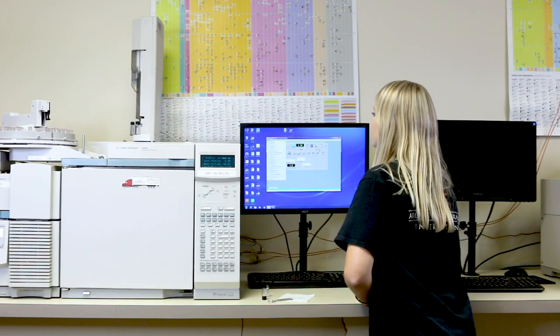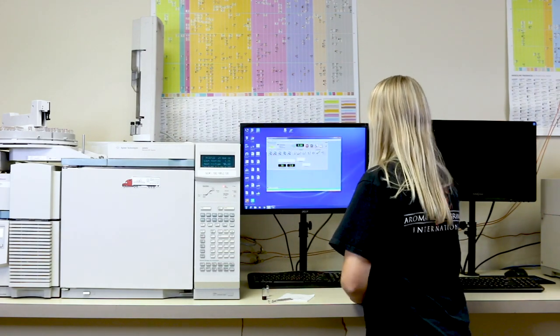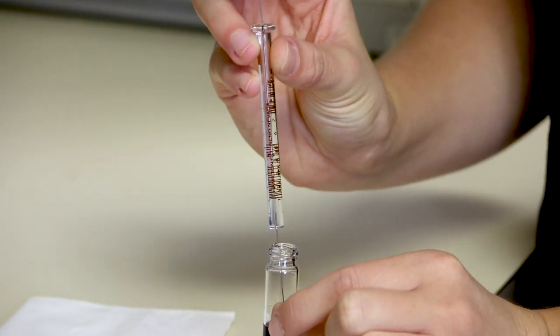We will now create a new project and fill in all the information we need. It's time to fill the syringe with the fragrance oil we want to duplicate. This is done three times to ensure the syringe is filled completely with the fragrance. Make sure not to capture any air bubbles.